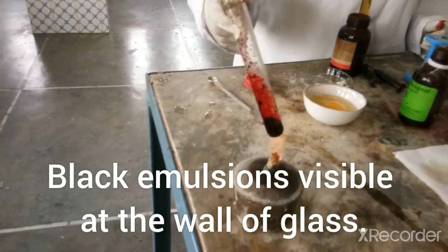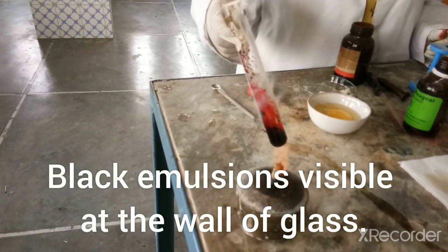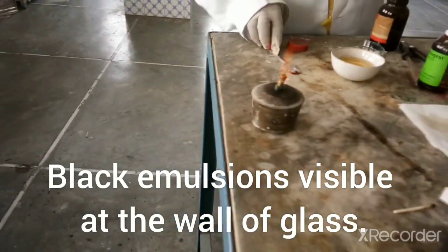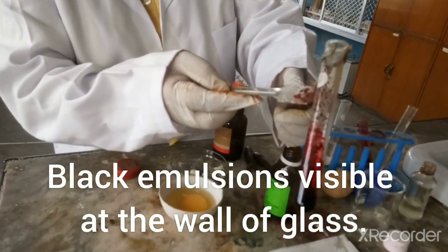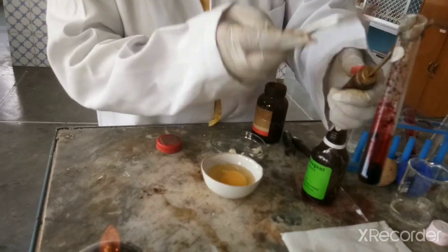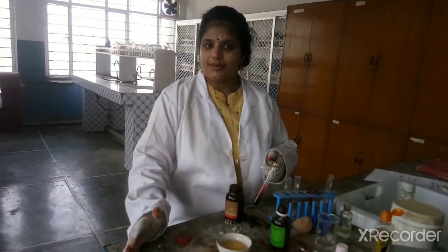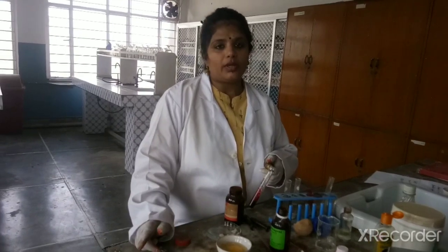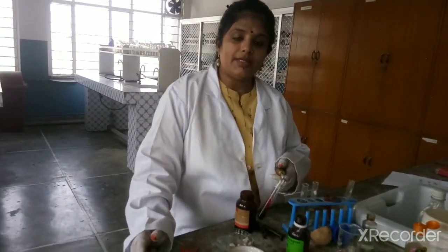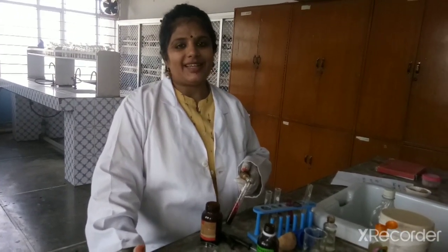Students, you are supposed to write all these experiments in your practical file and write down your observations. You can notice the small droplets — this is due to the emulsion formed by the fat. So in this video we have discussed the tests for fat and protein. The other experiment we are supposed to do in our practical file is the model of the digestive system. Till then, take care. Goodbye.